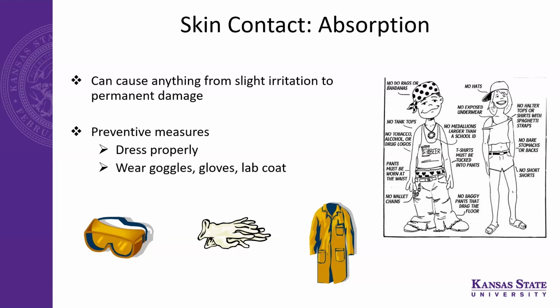No sandals, no flip-flops or anything. And one other thing that we encourage students is, now it's getting warmer, so they may come in shorts by mistake. They may forget that they have a chemistry lab later in the day, so they may wear shorts.